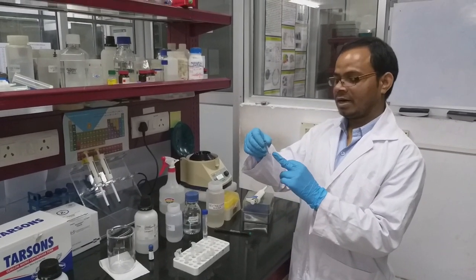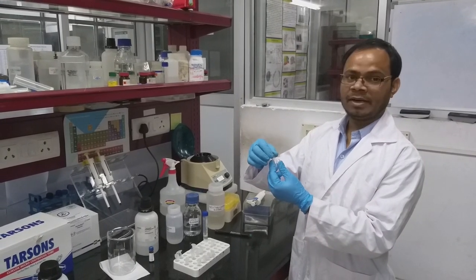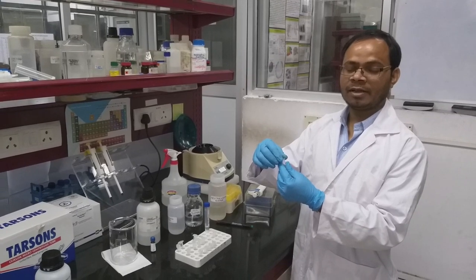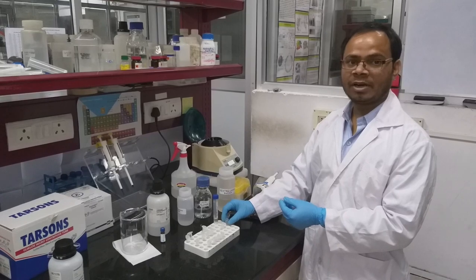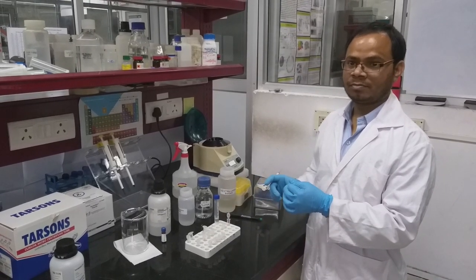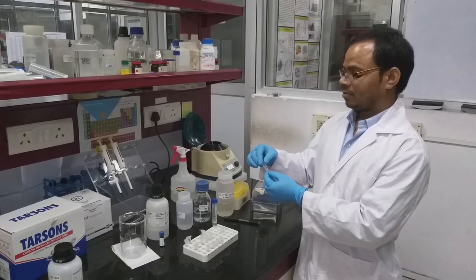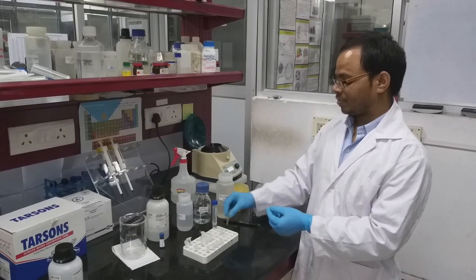Now we got the pellet, we have to air dry the pellet and dissolve it in deionized water or TE buffer. We will leave it at room temperature till the ethanol has evaporated. Next we will add TE.